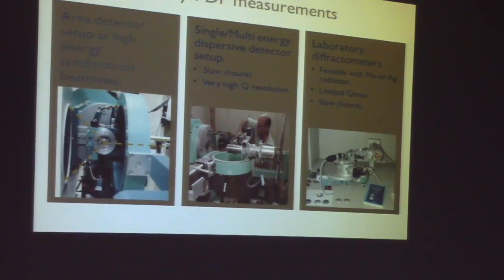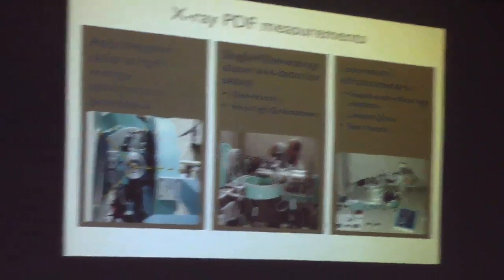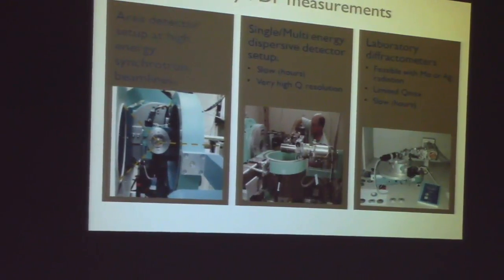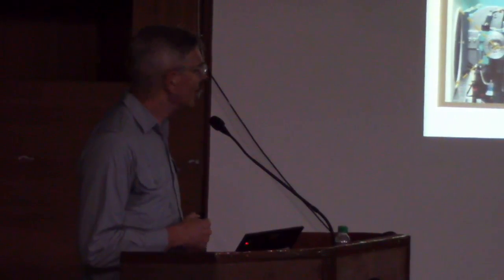And there are other diffractometers around the world where you can do this. For example, there's a high resolution powder diffractometer at ESRF in France. And again, at these facilities, you can apply for beam time by writing a proposal. And if it's successful, you'll get beam time. Of course, you still then have to travel to collect data.